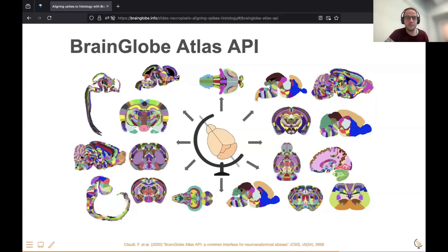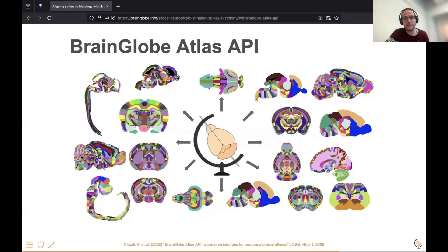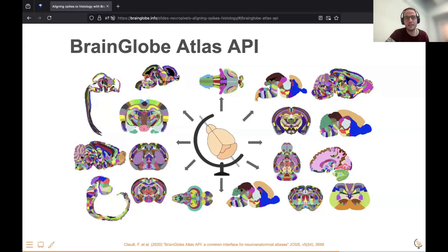This is not only possible for the mouse brain — we provide a large number of different atlases. A lot of this is rodent focused, but we have recently added various fish atlases and are working on making more. If you want an atlas that exists or have data with which to make one, chat to us. This is the core idea of BrainGlobe: you can use the same tools for any atlas that exists.